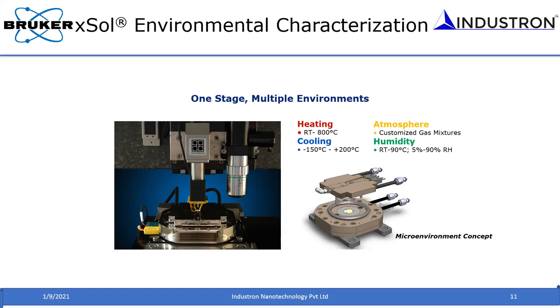You can see a small hole on the top heater through which the indenter tip passes, and that's the whole experiment. In this particular design, the important part is we engineered it in a way that we use thermal expansion to our advantage. We selected materials and did the design so the thermal expansion cancels each other. So the net thermal expansion along the z-axis is only 6 nanometers per degree C change in temperature. That allowed us to do experiments at the nanometer length scale.